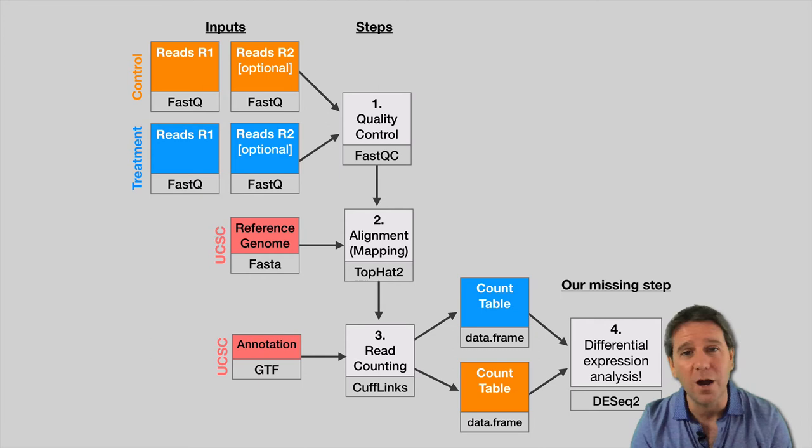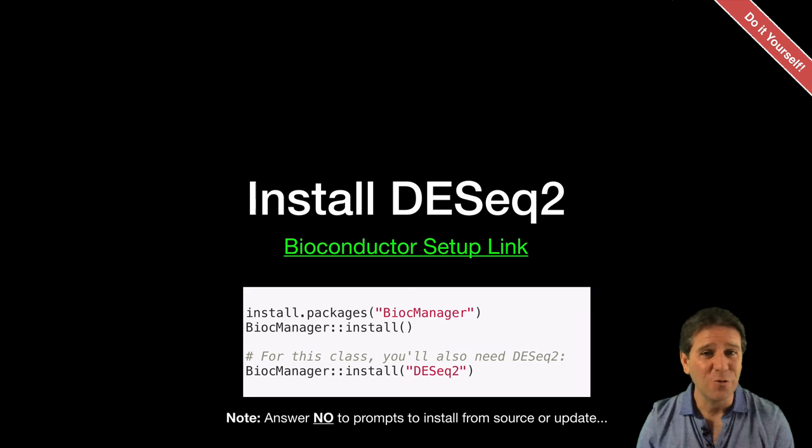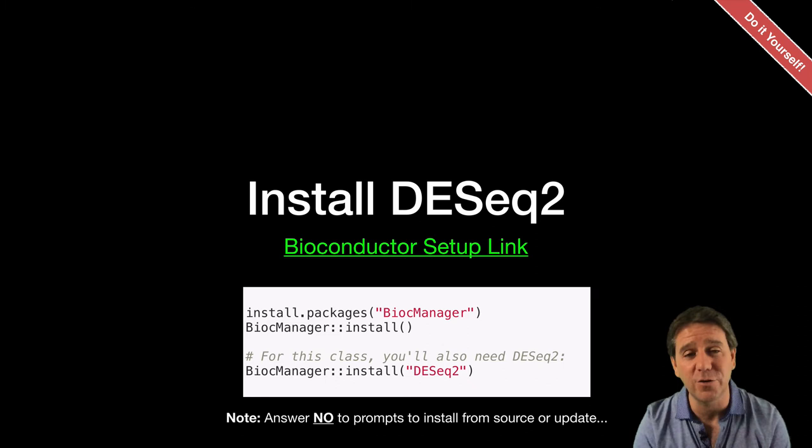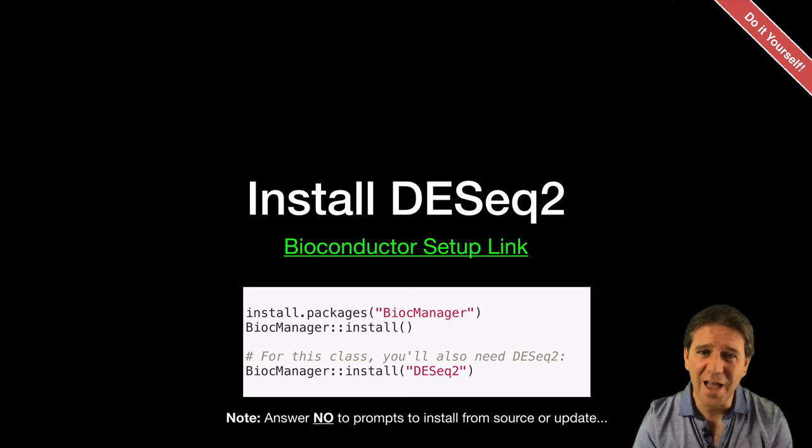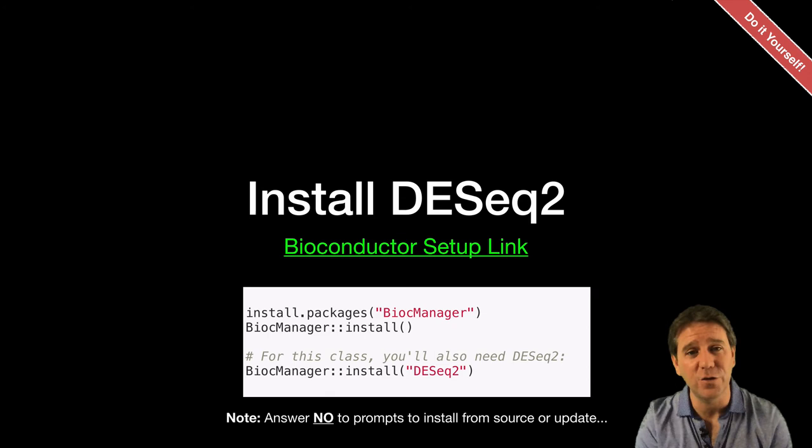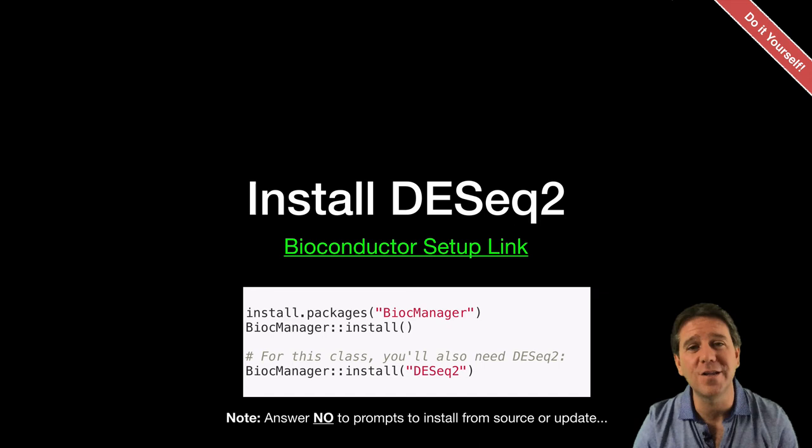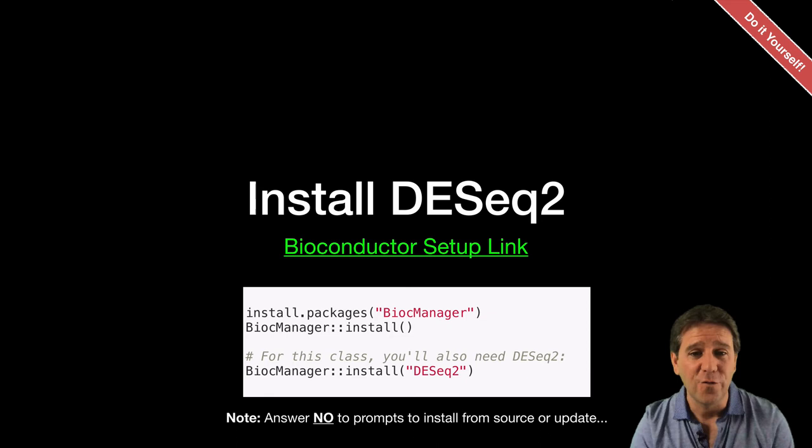We're going to actually explore DESeq2, one of the most widely regarded and commonly used packages for this kind of analysis. We're going to go over to RStudio and install this package from Bioconductor. Recall that the way we install packages from Bioconductor is different than from CRAN. For Bioconductor we must use this BiocManager install function. You're going to need to install the BiocManager package from CRAN first, and then from the BiocManager we're going to call this install function to set up Bioconductor, and then finally install individual packages like the DESeq2 package.